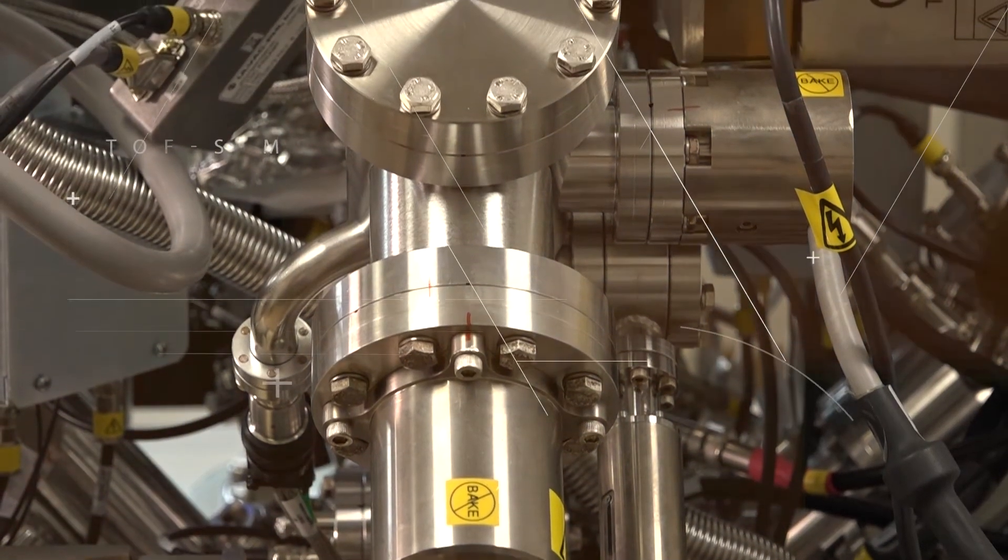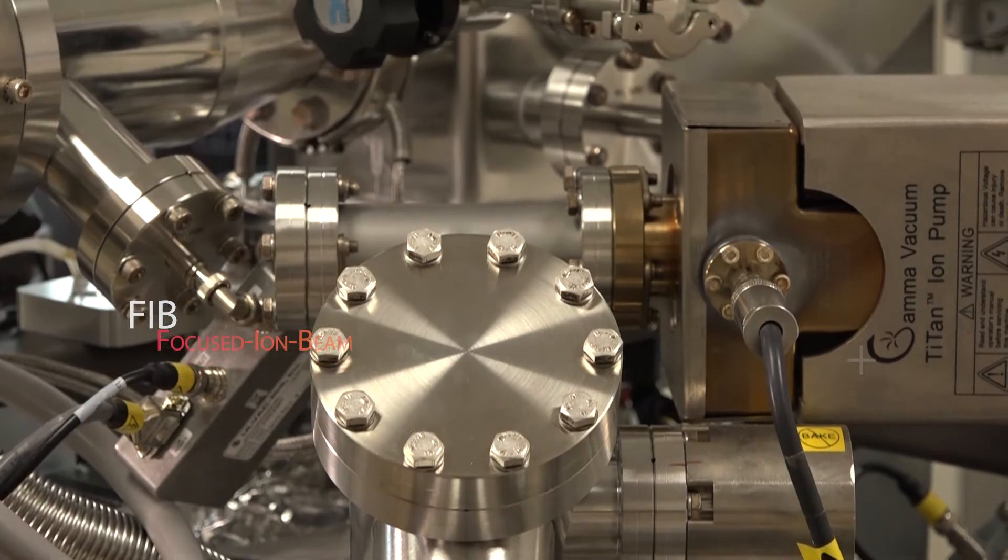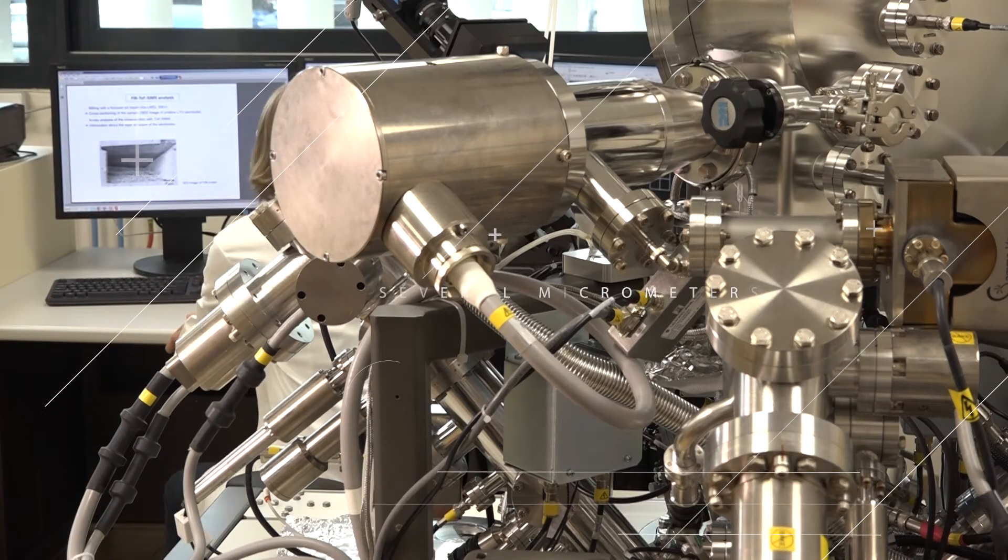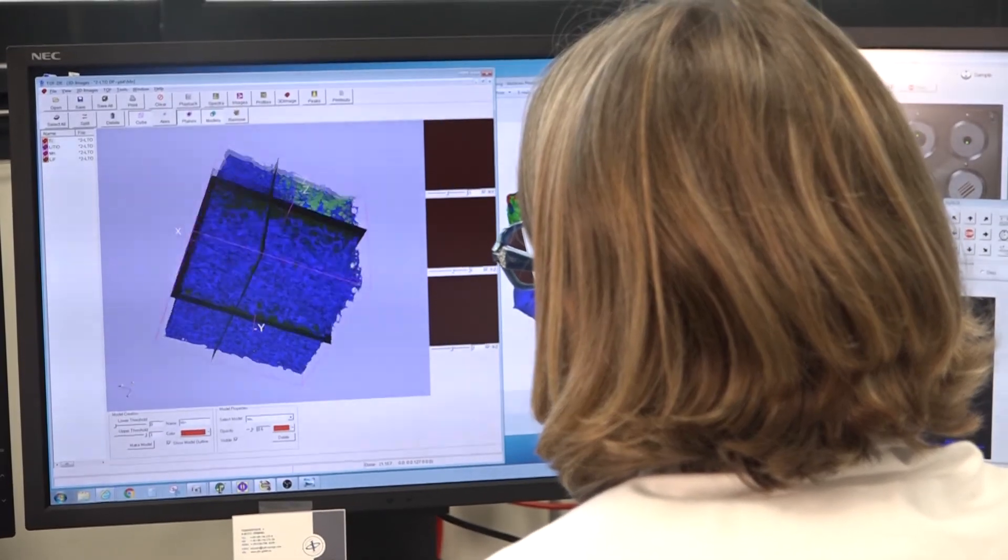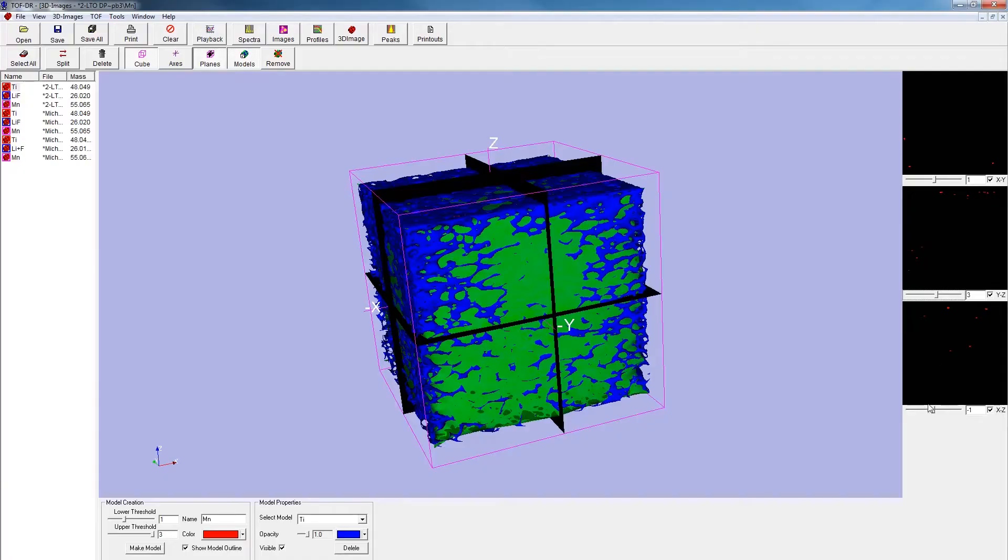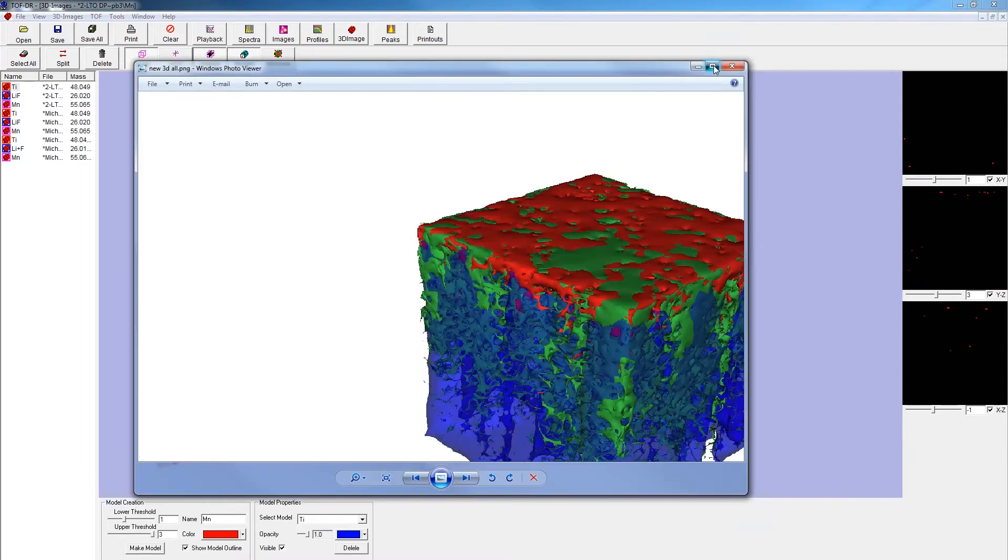A specificity of our TOF-SIMS machine is an in-situ focused ion beam, FIB, which allows performing 3D tomography over several micrometers. One of our main research fields is the study of lithium or sodium ion batteries for electric vehicles, smart grids, or electronic devices.